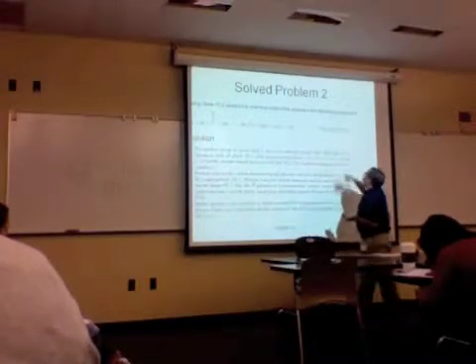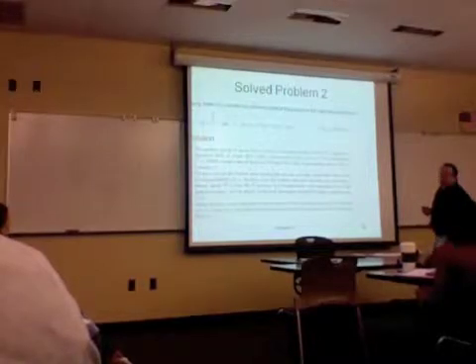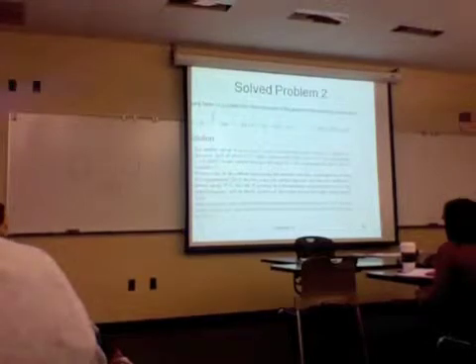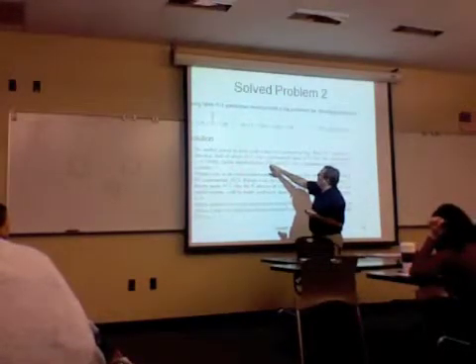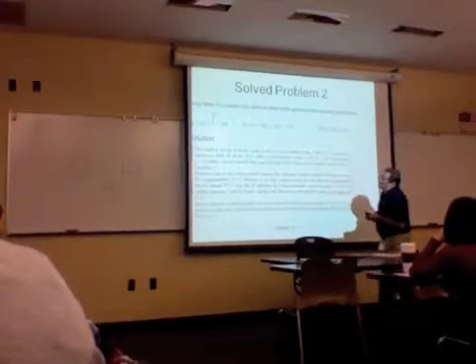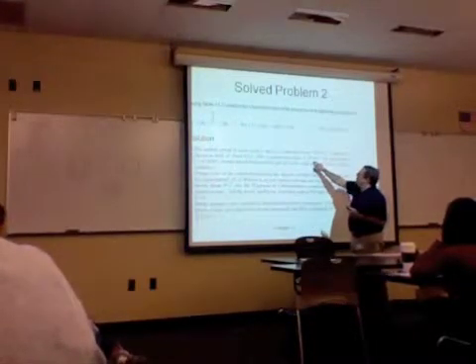And over here, I've got a double bond, so we expect considerable downfield shift here and here for B and C because they're different. And then the A's will be downfield a little bit, but not much. Does that make sense? Again, it's a proximity thing. And we could go to the tables and get accurate values, but let's look at our predictions and see how they did. The carboxylic hydrogen, between 10 and 12, the experimental value in this case is 11.4. And by the way, the methyl group up here, because it's next to the carbonyl group, is down about 2.1.